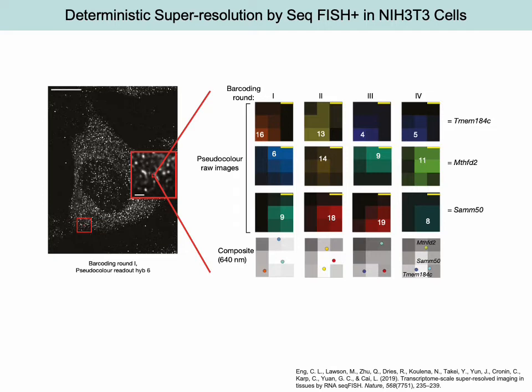This can be repeated over 3 or 4 rounds, and you can start barcoding the transcripts. For example, this color shows number 16 as a pseudo color, and on the first barcode, you could decode exactly which gene it is because this is how you design the DNA probes. That way, they spell out this particular barcode. So this is how they could do the experiment with 10,000 genes.